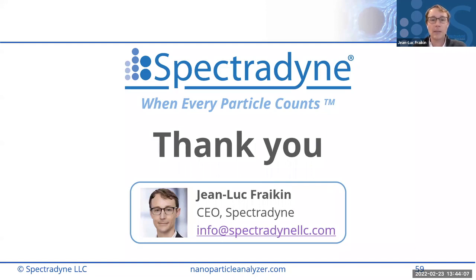I think the idea is basically that if you throw a charged particle through with a different zeta potential, it will affect the transit time of the particle. It'll either go faster or slower. But in our experience, the logistics of doing these kind of measurements with RPS generally are rather cumbersome. So we haven't pushed too hard on that.